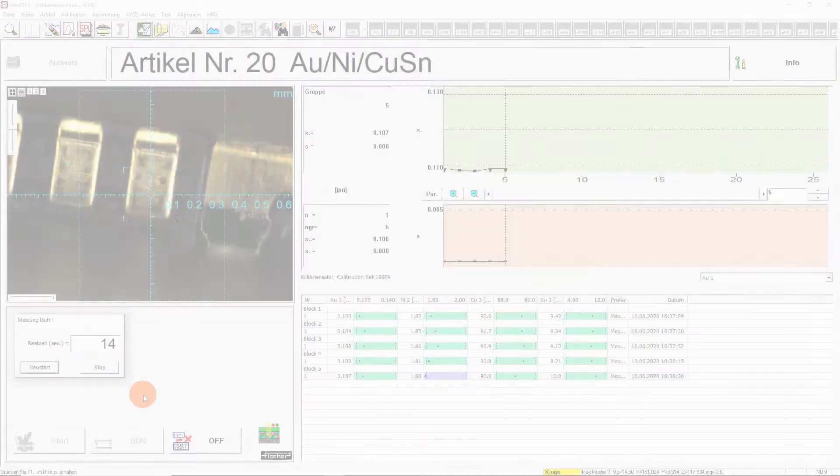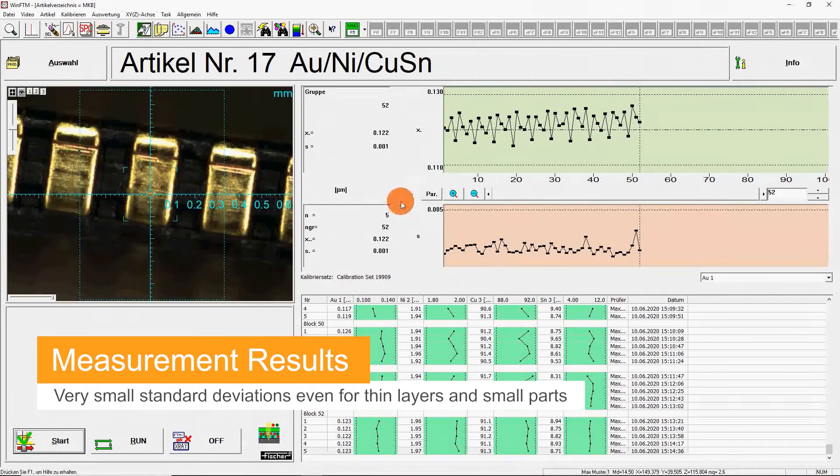Hereby, measurement device capability can almost always be achieved. Fischer Scope X-ray XTV Mu, the XRF measuring device of the Champions League.